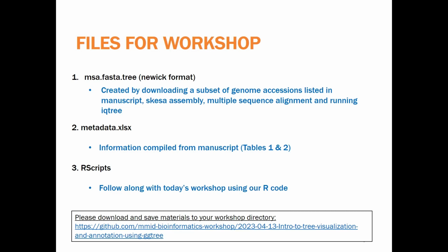So if you can open up and save the materials to your workshop directory, it's on our GitHub page for today's workshop. I can give you a few moments to do so if you guys haven't done that already. Let me know if there's any issues.